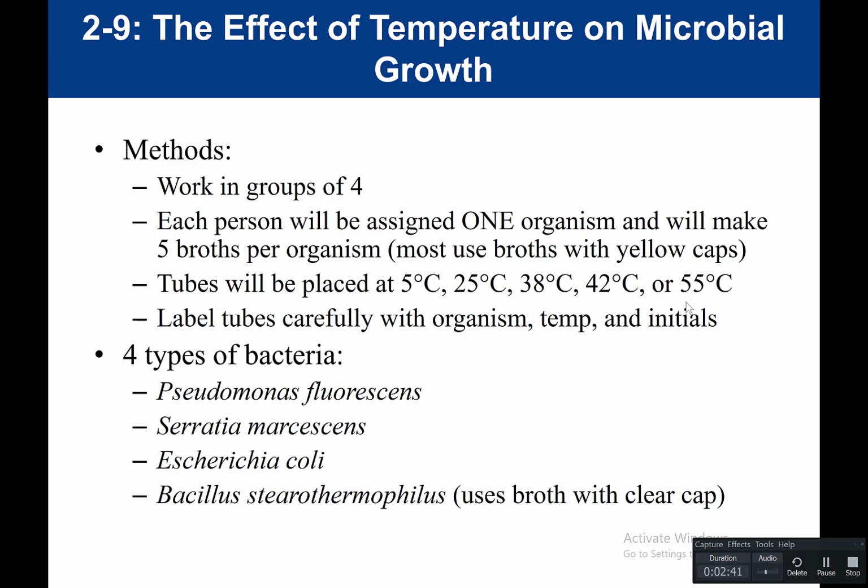And so you would do this for all 4 bacteria. And what we want to see is for each of these 4 bacteria, which temperature do they grow at? And which temperature do they grow best? That is going to tell us what temperatures each bacteria can grow within. What is their range of temperatures in which they can grow? And so this would be our setup for our temperature experiment.